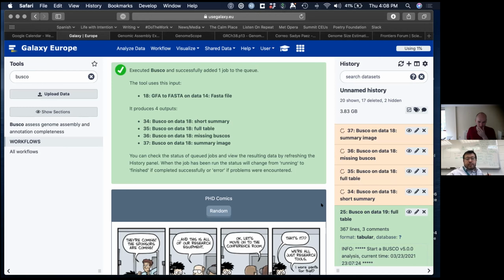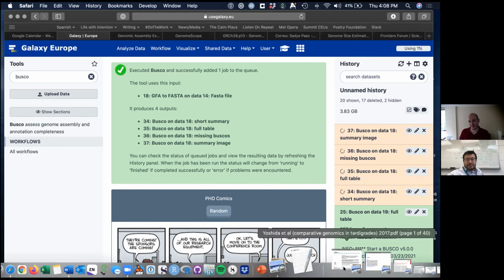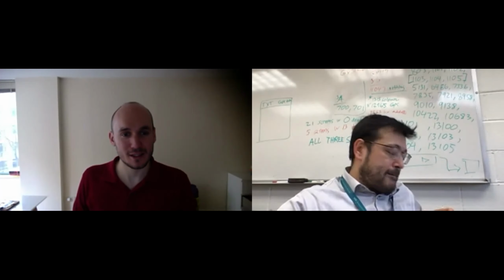I'm sure you can take the output in Galaxy and calculate the frequency for each column. But do you have it, Julie, already done? If you want to show yours. Actually, I don't. I'll see if it runs, but it might take a little bit. I think it's gonna make it. It's very fast actually at this point.